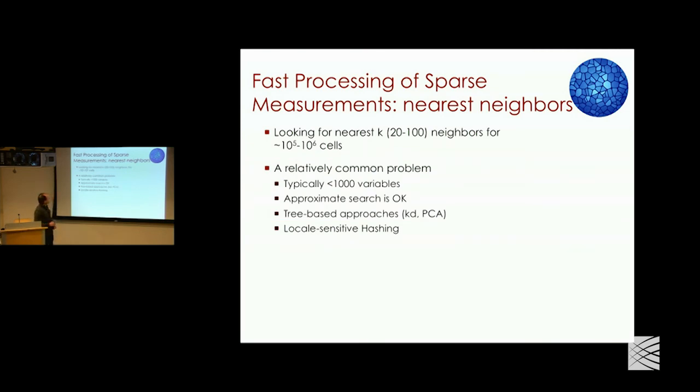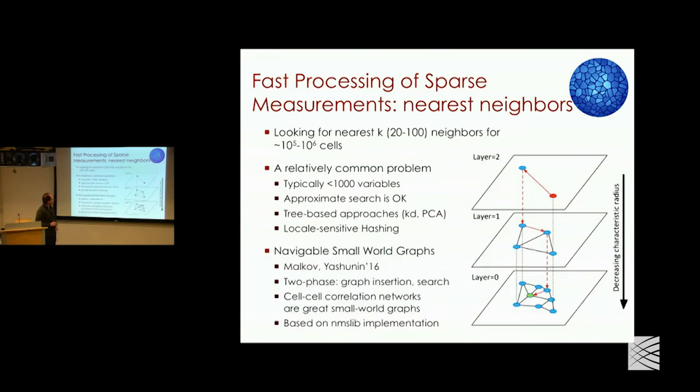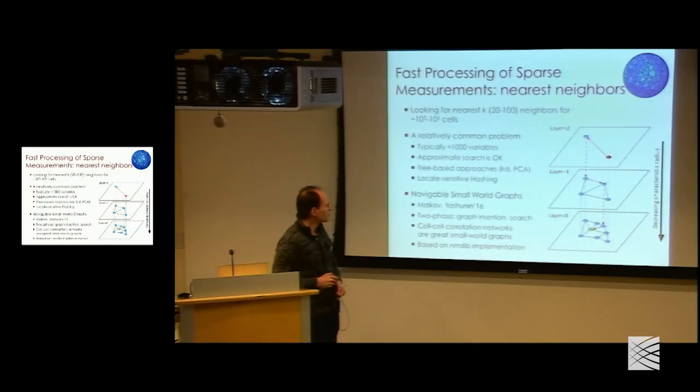and so on. So the idea is based on small world graphs, which I used to work with in metabolic network analysis at some point, and so I still remember this a little bit, but I didn't think they were very useful, but here apparently they are. So the idea is very simple. If you're trying to navigate a small world network, you can actually do this very efficiently, right? So the idea here is to incorporate, in this case, cells into multiple layers, where the hubs of your network will be on the top, and then less hubby nodes will be a little bit lower, and so on.